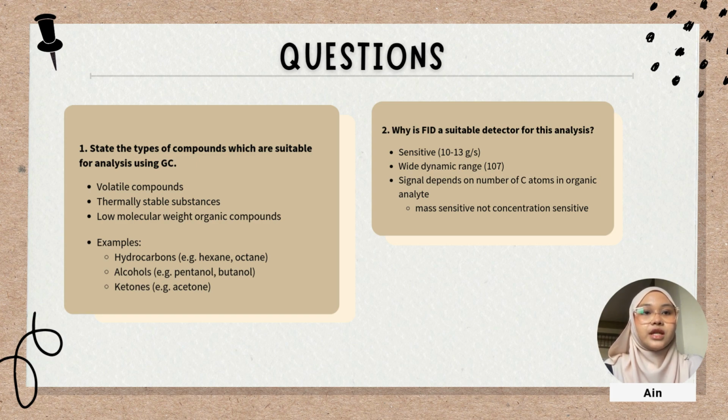FID is a suitable detector for this analysis because it is highly sensitive and has a wide dynamic range. The signal produced depends on the number of carbon atoms in the organic analyte, making it suitable for organic compound analysis. In addition, FID is mass sensitive rather than concentration sensitive.